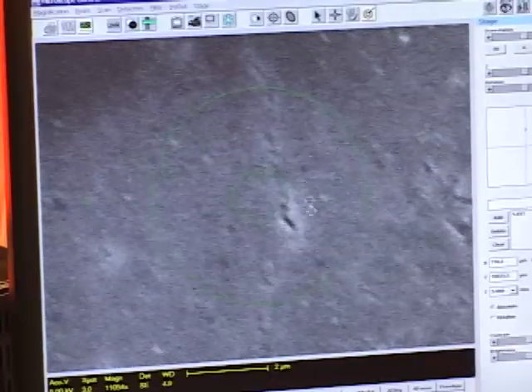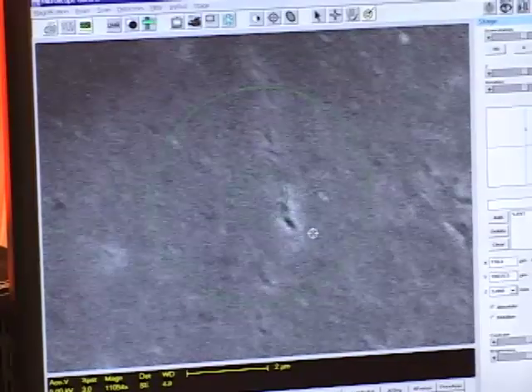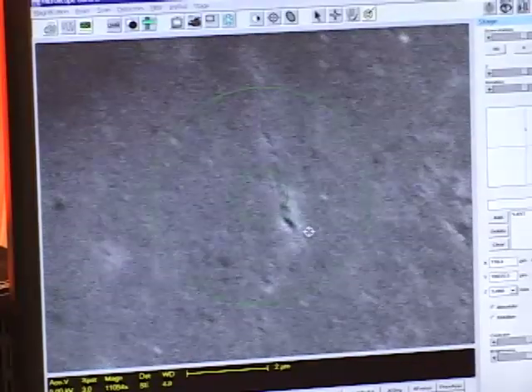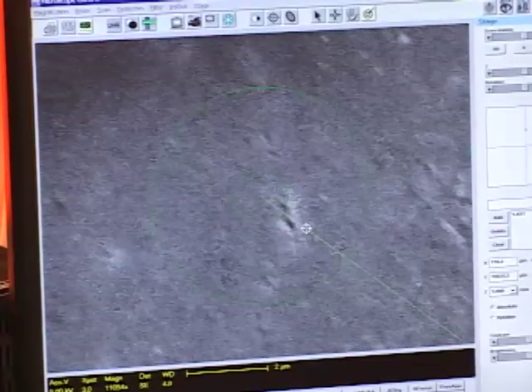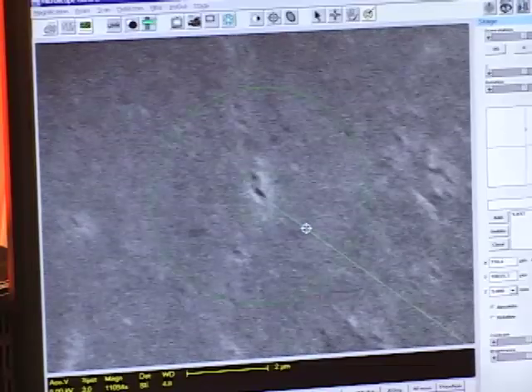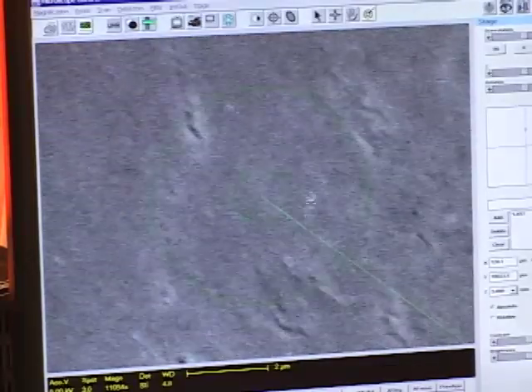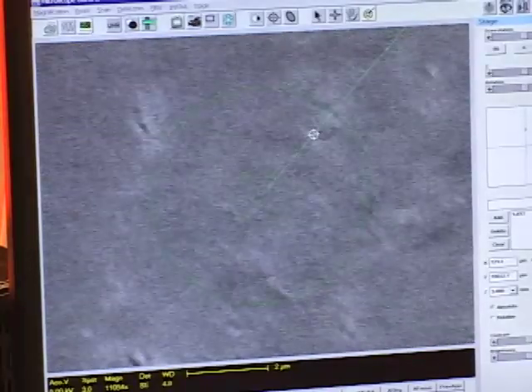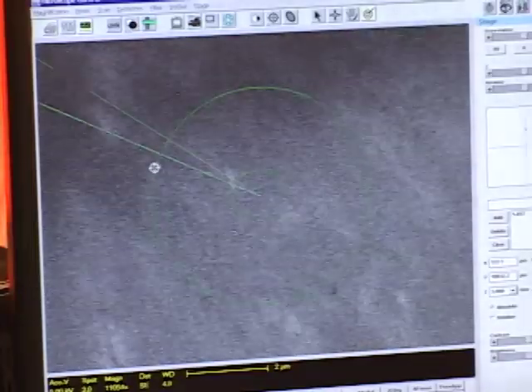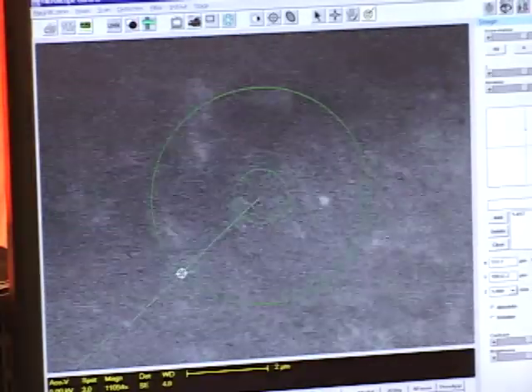I'm at 11,000. I want to bring this feature to the center using the get mode. When I left click anywhere outside of the donut hole, you see the stage will track that direction. You can see there are pretty rough movements — under high magnification you can actually see the step size of the motor.